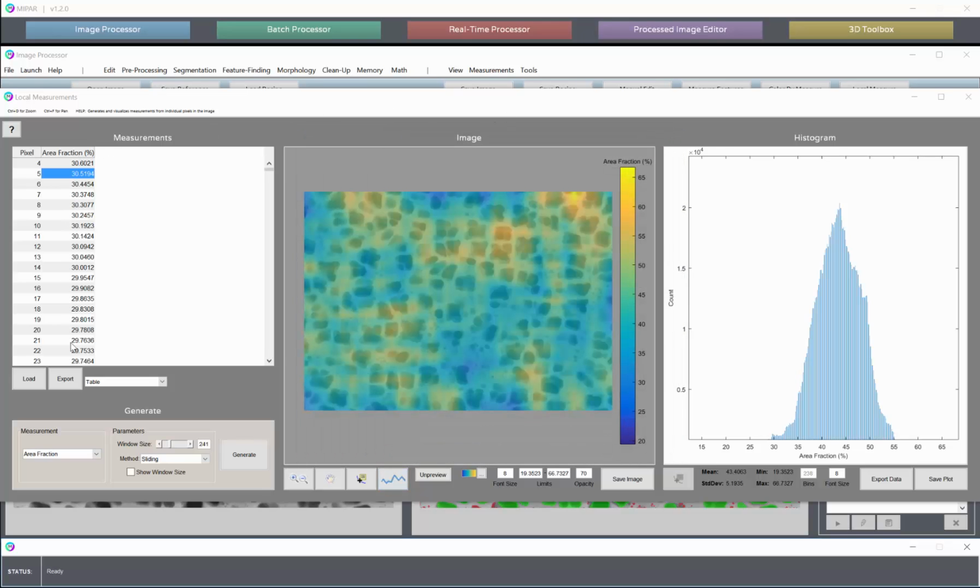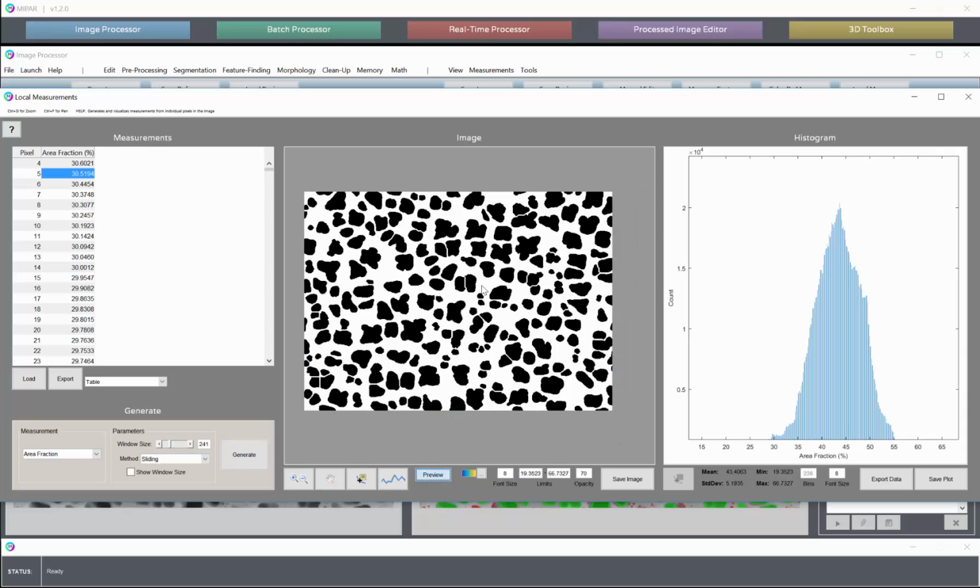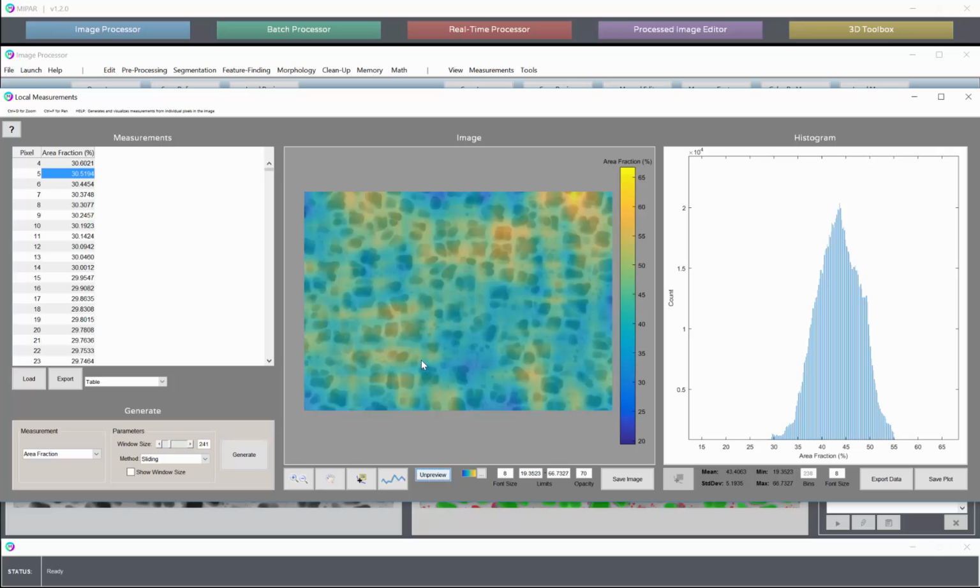And you, of course, may export the entire table that you see here, or even an average of the map values, whatever is mapped, that fall inside of the features that generated the map in the first place. So it's perhaps more useful with something like thickness, where if you have the local thickness of every feature plotted, you can then export a spreadsheet that has the average thickness per feature, which can then be imported into the color by measure tool to display a single average thickness value per feature.